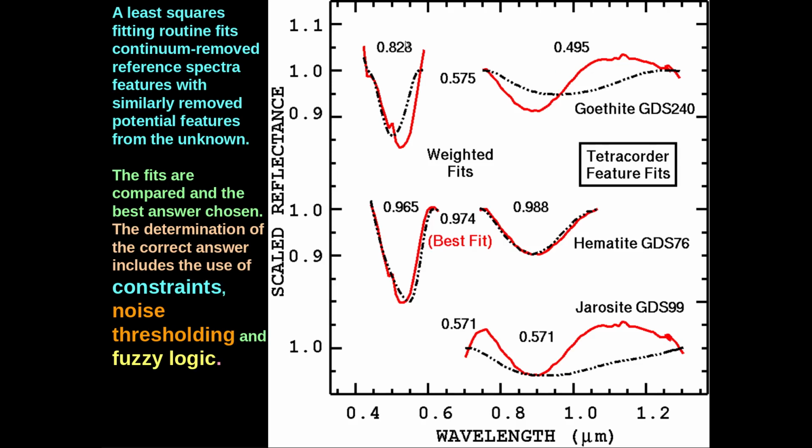So these are the fit numbers, the correlation coefficients to the least squares fit. We include the continuum endpoints, and that's why some of these are going up above. We've done studies to show that that helps in determining the fit.